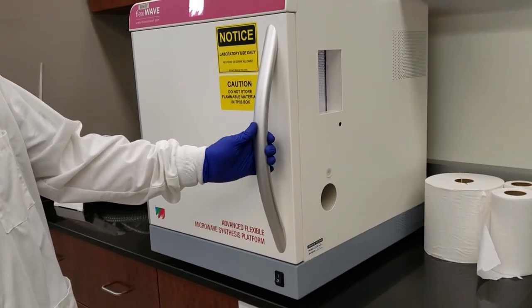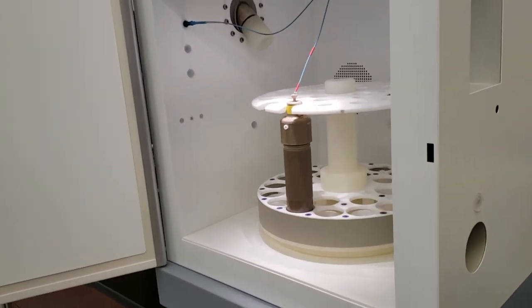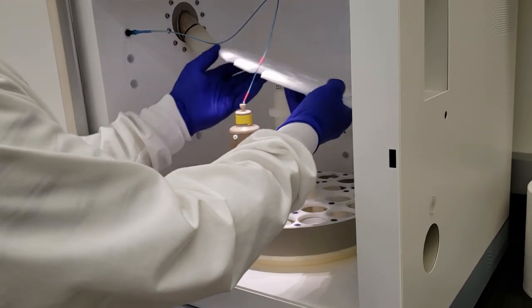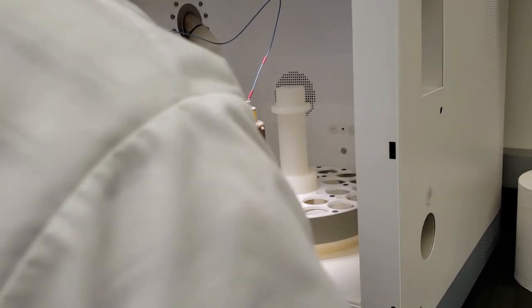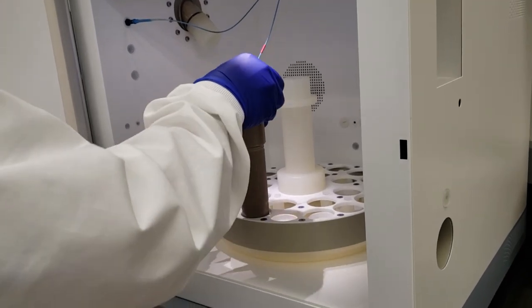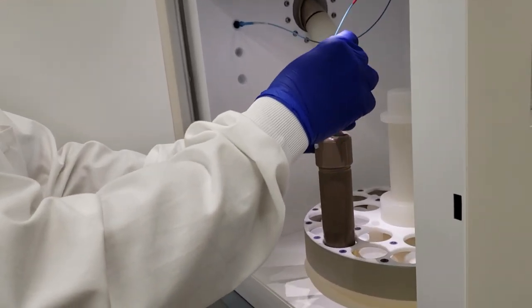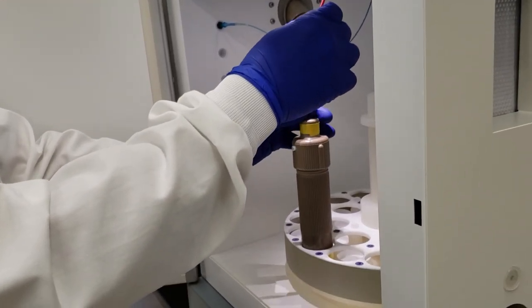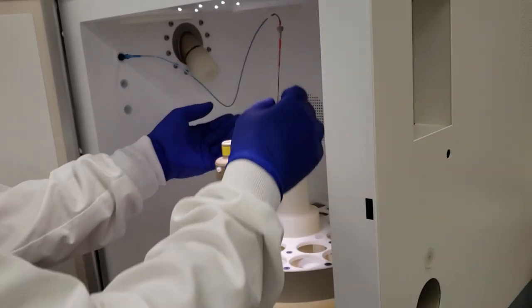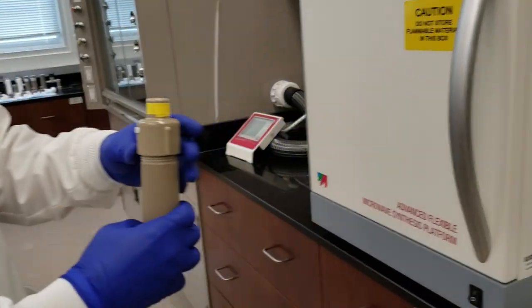So our microwave reflux is finished. We're going to go ahead and retrieve our vessel from the instrument. Take our brace off. Set it aside. I'm going to carefully remove the fiber optic. Of course, we're taking that out of the thermal well at the center of our reaction vessel. Take this over to the hood and open it up.